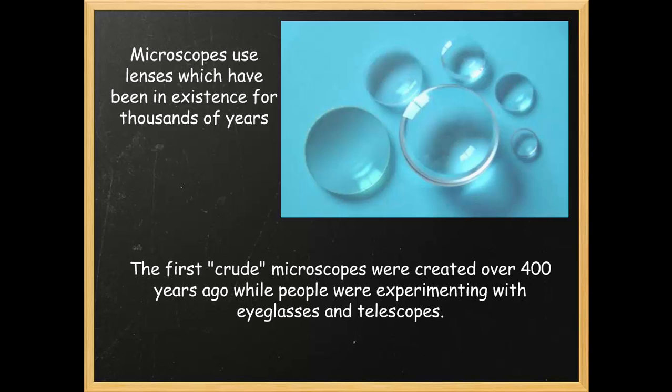The first crude microscopes, and we're using the word crude as in rough or not very accurate, were created over 400 years ago while people were experimenting with eyeglasses and telescopes.